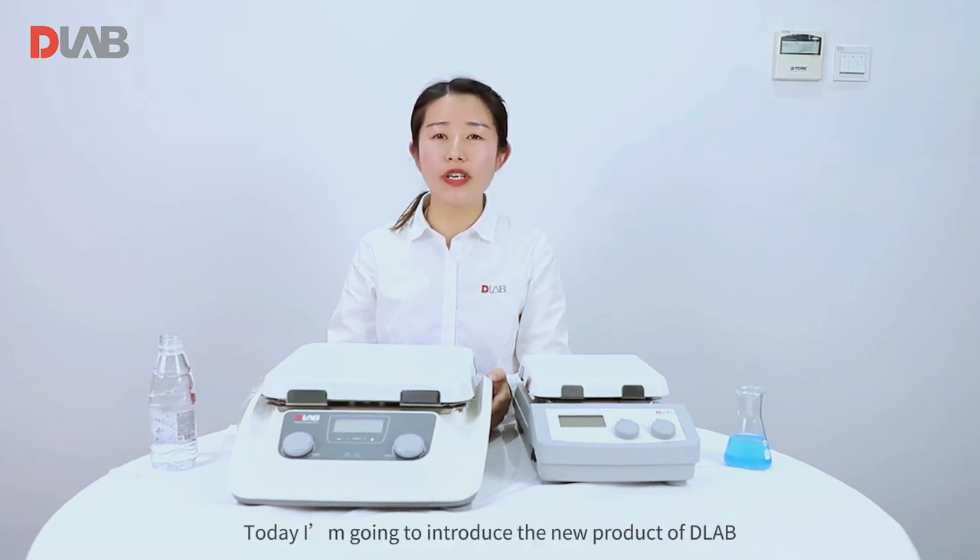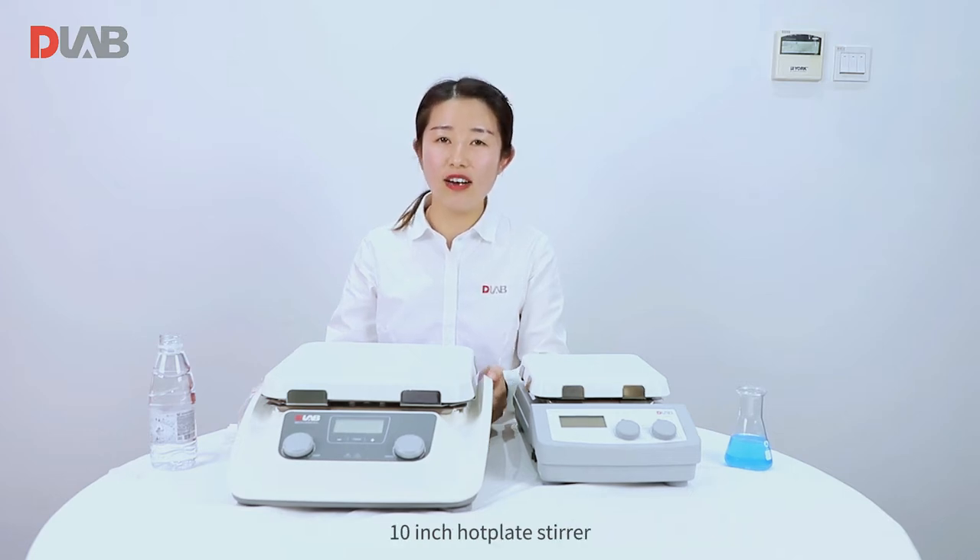Hello everyone, I'm Jessie from D-Lab. Today I'm going to introduce the new product of D-Lab: the 10-inch hot plate stirrer.